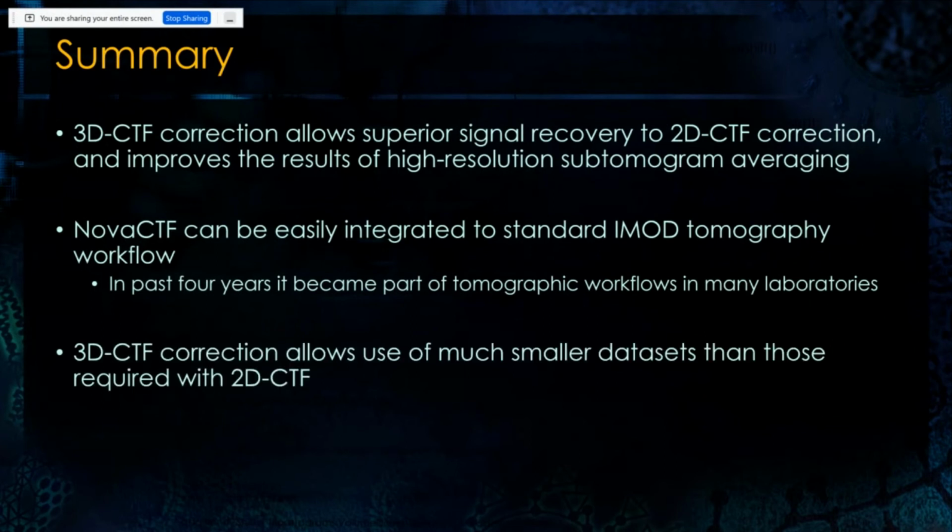And for me, one of the most important things here, I think, is that we also show that when you spend some time on processing and when you don't try to cut the corners there, you actually can achieve really nice results with not so much data. And I think that especially in times when not everyone has unlimited access to the good microscopes, it's very good to know that one can still squeeze out much more from the data if one takes one's own time.